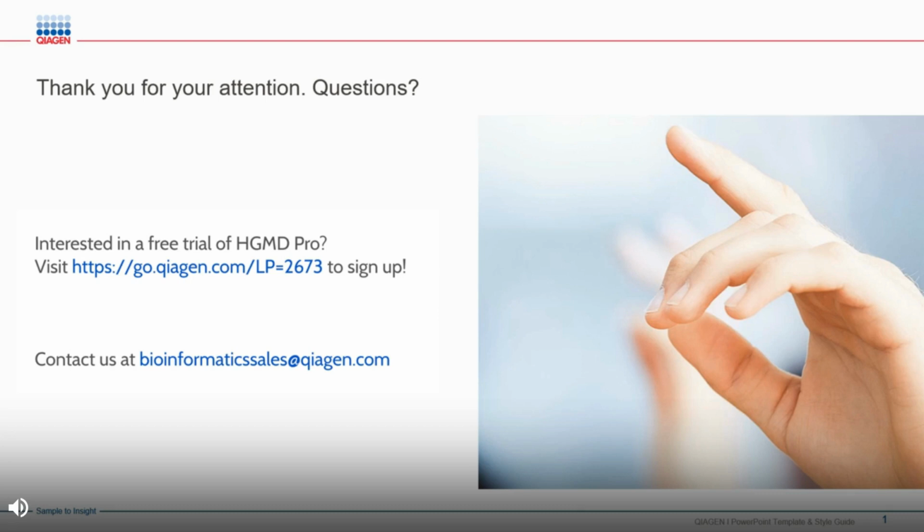Why are there articles for a specific variant that have not been captured in HGMD but can be found using other search tools such as Google Scholar, PubMed, etc.? Right. So you will note that there are just a few articles shown, and really the aim of HGMD is to show the primary report, that first report where the variant is published in the literature. And the additional articles are really only added if there's something new or important that they add.